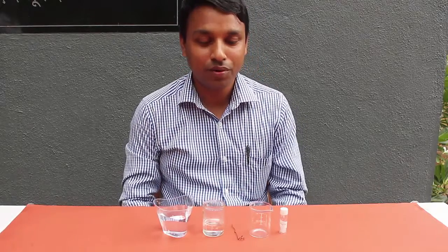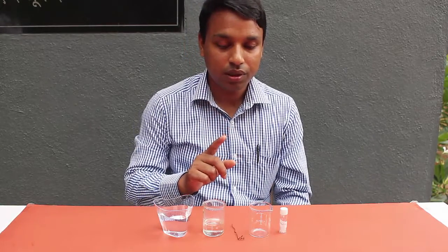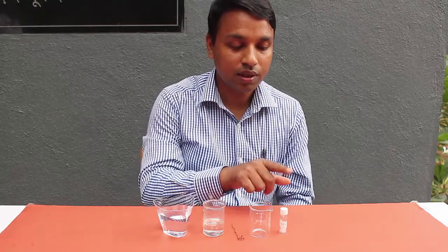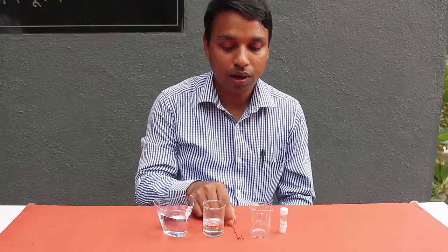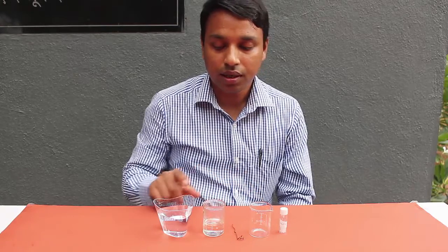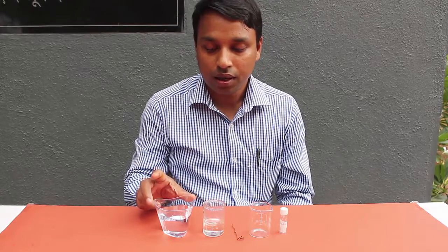Hello friends, today we are going to do an experiment in which we can see how an iron wire bleeds. For this we need some chemicals: ammonium thiocyanate, nitric acid, an iron wire, an empty beaker, and a cup of water.